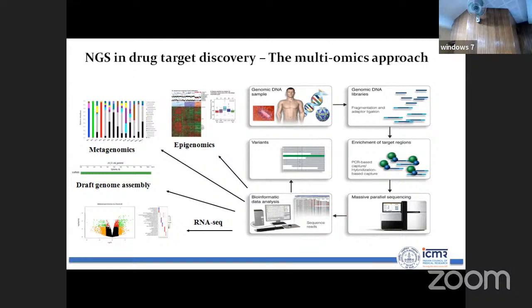Now you identified, say, 10,000 variants in the drug resistance trait. These are SNPs or indels. Now you compare these two in susceptible and resistant. Say you have 10,000 in one, 8,000 in the other, and the common might be 5,000. You remove those 5,000 common ones, and there might be 2,000 unique drug resistance traits. I hope it is clear. Of course, I will be giving another example with human data in future slides.